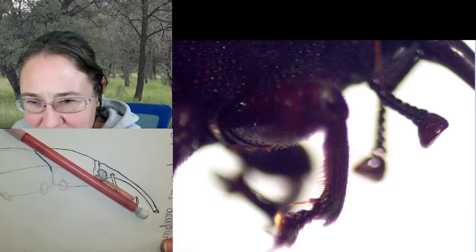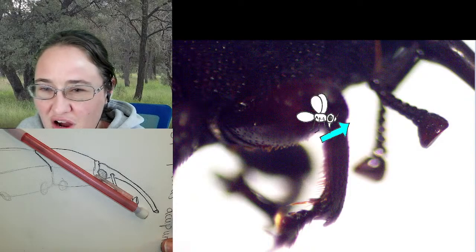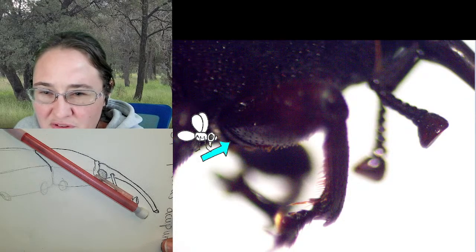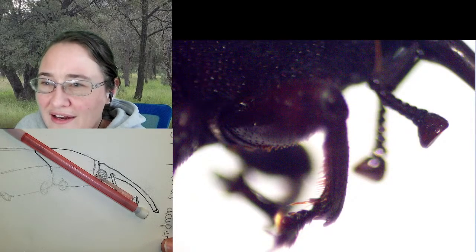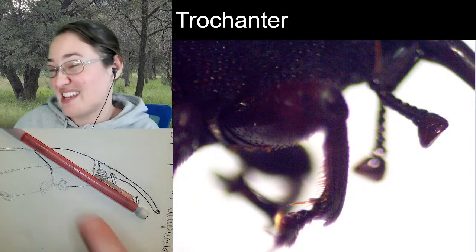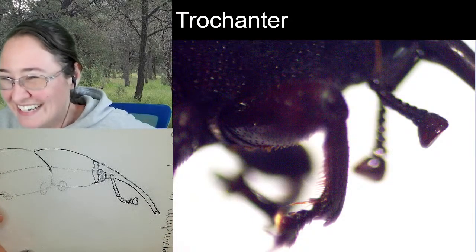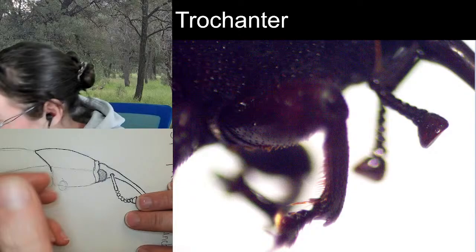We can a little bit see a trochanter if we look really, really hard. It's this little bit of a sliver from here to here. You can see there's this little segment. That is what we would consider a trochanter. It's kind of like a knee that insects have between their hip and their femur. So it's like an extra joint that helps their femur bend at the right angle.